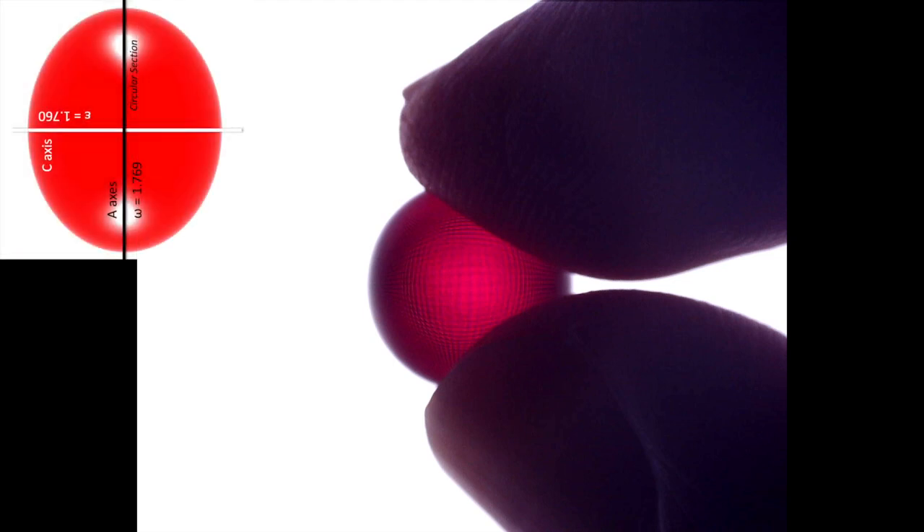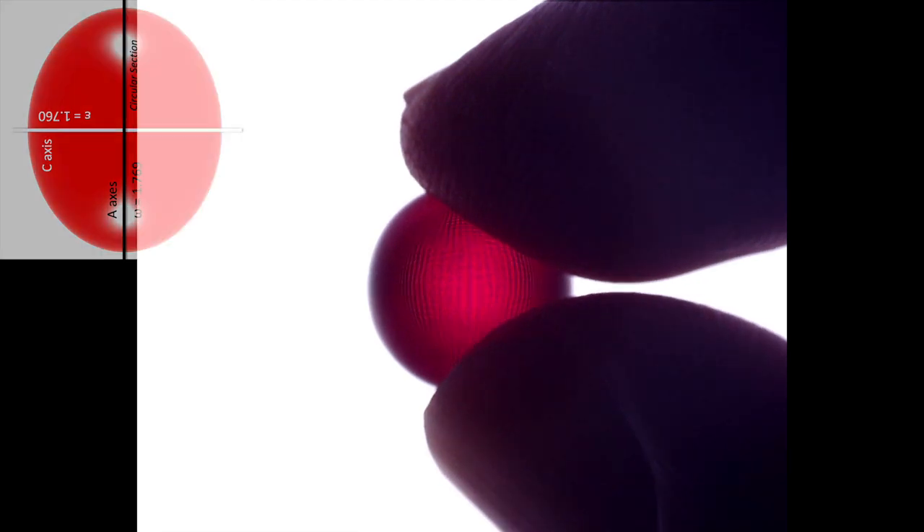Did I mention that cubes are better than spheres? We stop the rotation in an orientation aligned with refractive index omega. Bringing in the upper polarizer confirms our sphere is at extinction — we are indeed aligned with refractive index omega. We begin to rotate the sphere and light starts to be transmitted as an interference color. And then of course the sphere rolls away, beginning the journey of reorientation. Since we were essentially at the end of that demonstration anyway, let's go take a look at the bigger 20 millimeter corundum sphere.